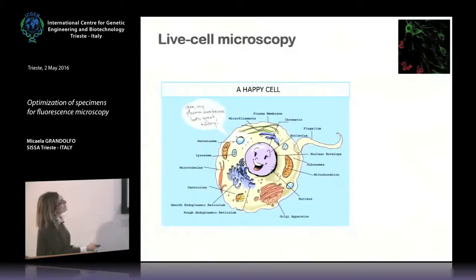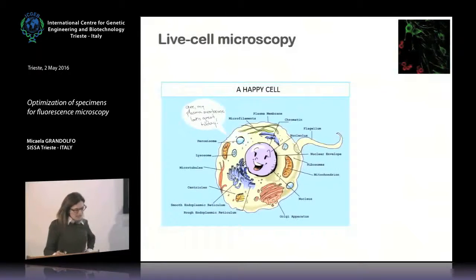Okay, and now just a few words about live cell microscopy. Also in this case, as you know, there is an enormous amount of useful information to collect to design a good experiment in live cell microscopy.